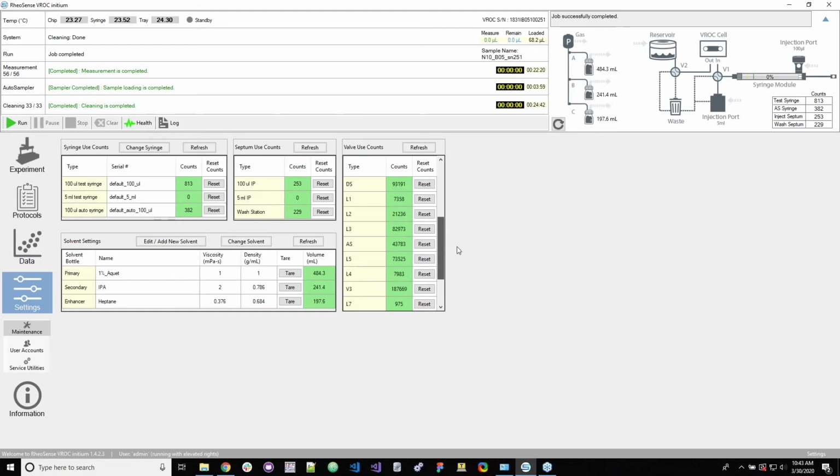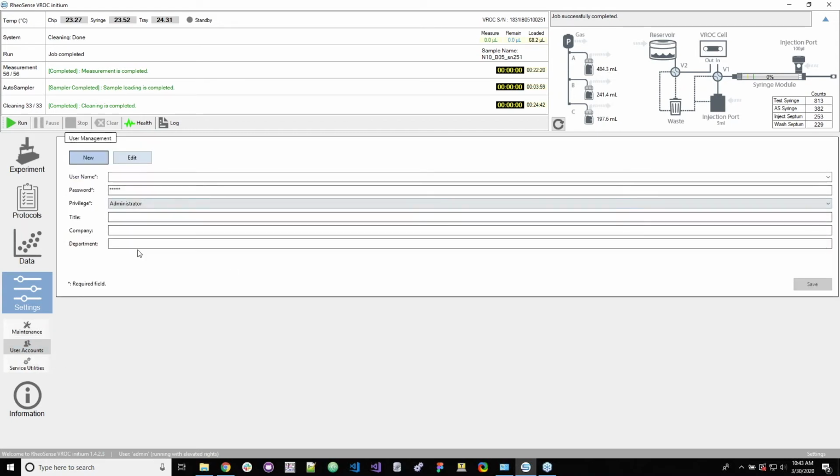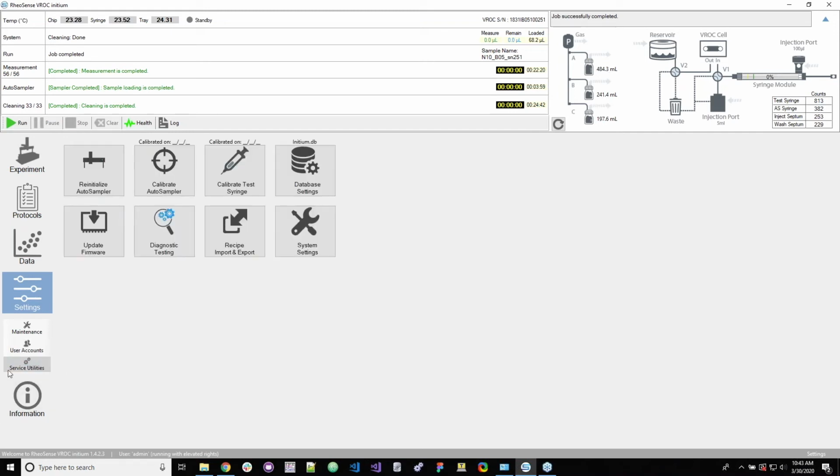Then we can go through the settings tab, which is just showing you here the usage counts for each of the consumables in the instrument, the volume of the solvents being used, and all that good stuff. And then you can also create user accounts here, and also look at the service utilities tab. So you can click this button to reinitialize the autosampler. Whenever you start the initium software, the autosampler will go through a dummy run just to make sure that it's ready to go. So you can click that, and the noise you're hearing is the autosampler initializing itself. It's just going through its own diagnostic setup to make sure that it's functioning properly.